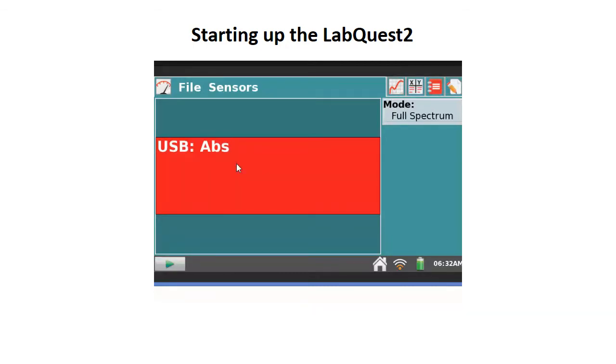We're set to go. We'll go through a couple slides showing you how you're going to put your samples in and make sure we have that down, and then we'll come back to this and look at how we're going to handle the data in it. So let me go ahead and stop this.